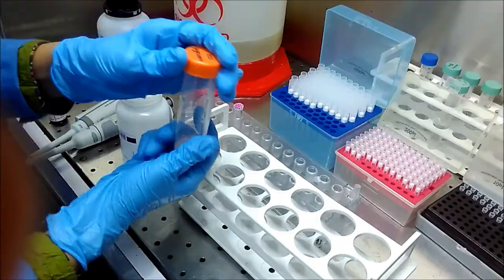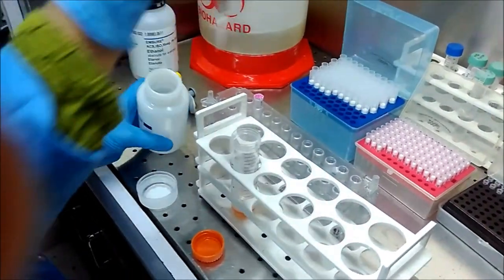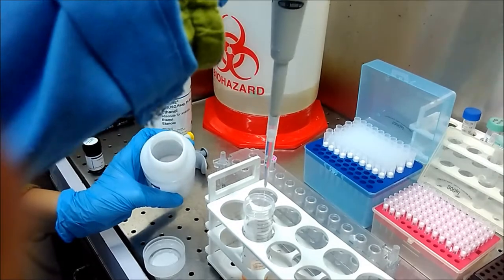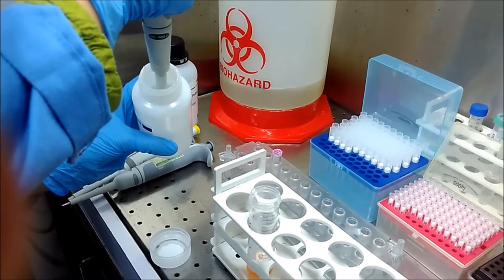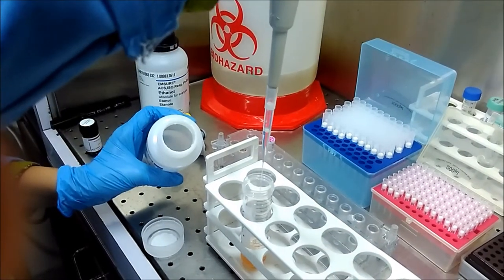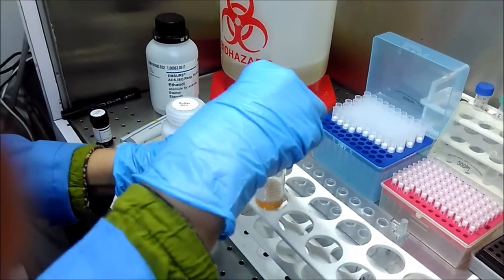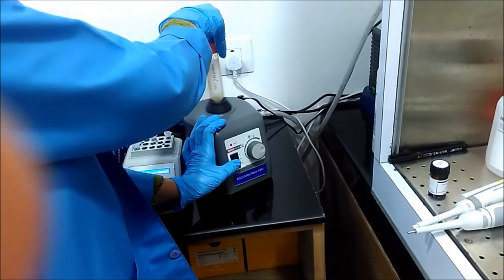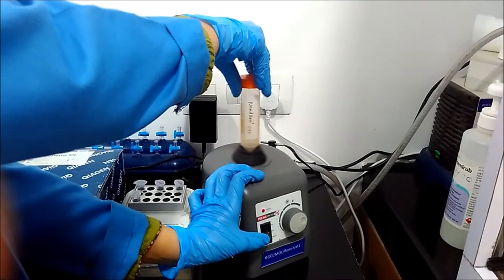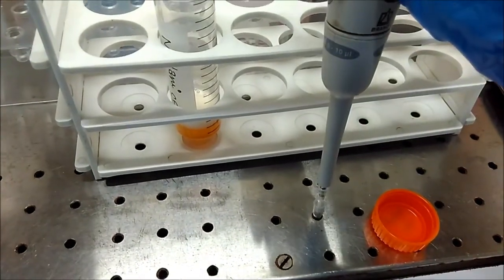We are doing vortexing here. After that, we will keep this mixture for 5 to 6 minutes at room temperature. Then I am going to add lysis buffer — that is ACL buffer — 4 ml as per the protocol. ACL buffer is basically a lysis buffer that will lyse all the cells and debris in the plasma. We vortex it for 10 to 15 seconds so that the lysis buffer gets mixed properly with the plasma sample.